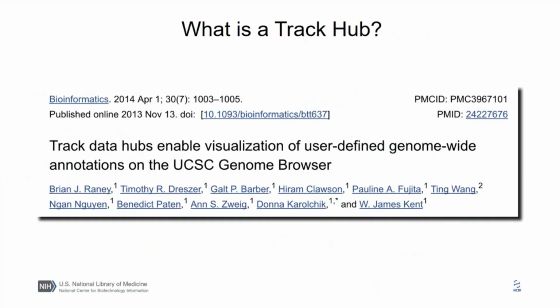So let's start with what is a Track Hub. And I put this reference up here for two reasons. One, it's a great source of background information on what Track Hubs are. So if you're not that familiar with them, this would be a good place to get information. It also reminds me that Track Hubs are not an NCBI product, so don't want there to be any confusion about that. These were developed by the good folks at UCSC.